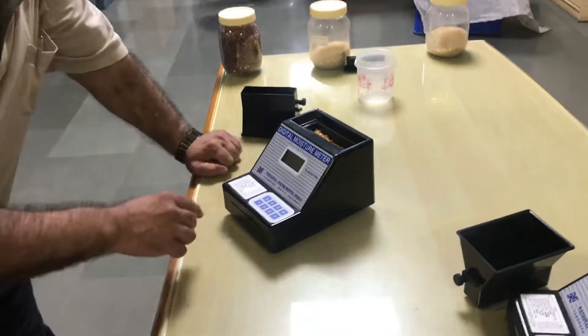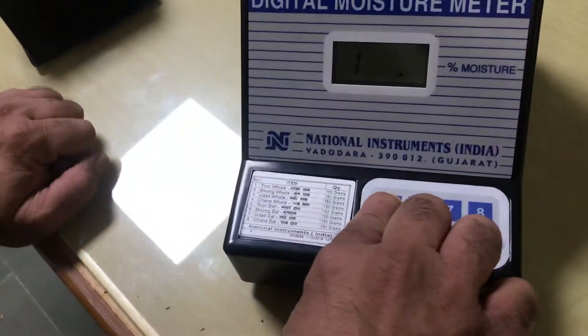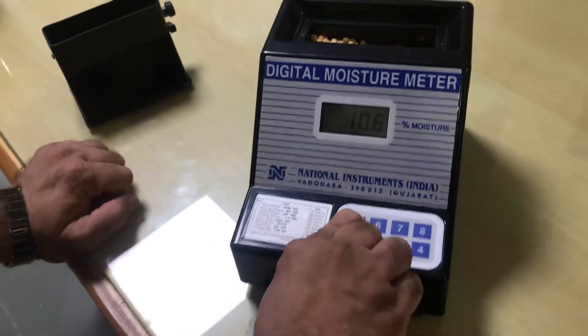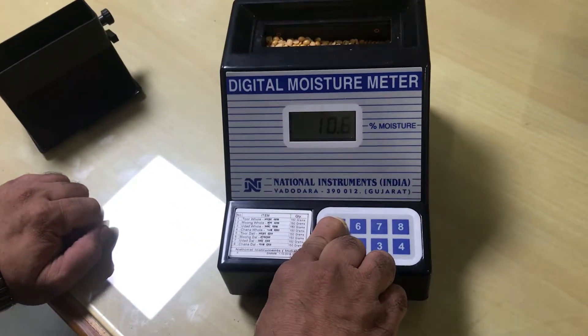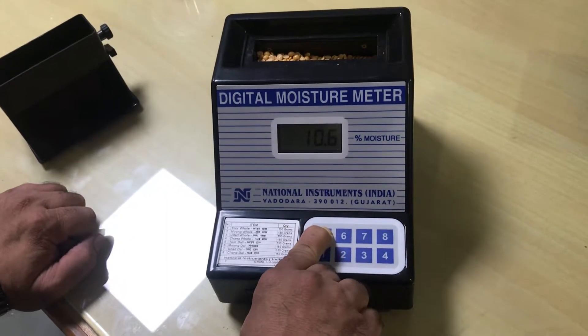You can see, now we are pressing the number 5 key which is calibrated for toor dha. So this instrument will display you the percentage moisture in toor dha. It indicates 10.6% moisture in toor dha.